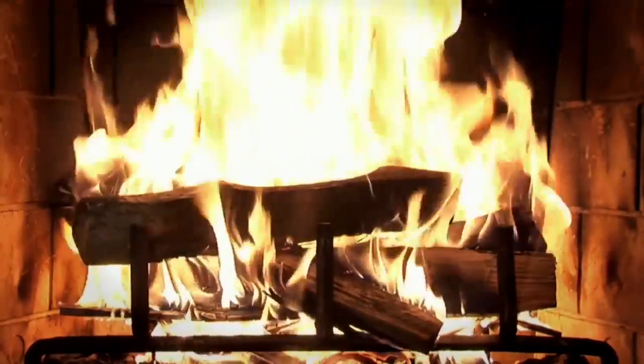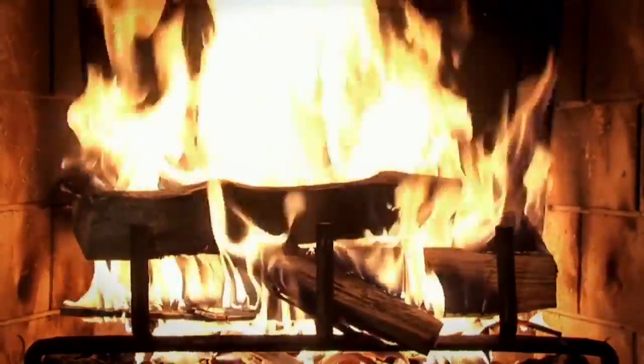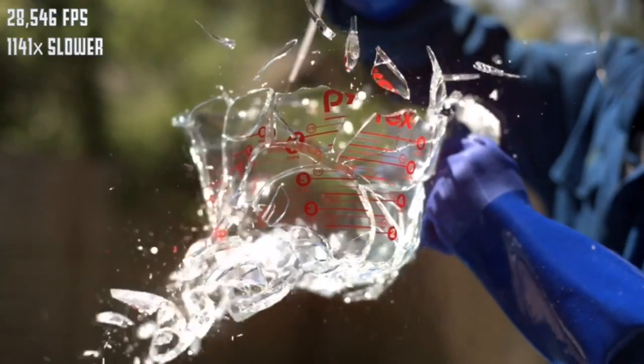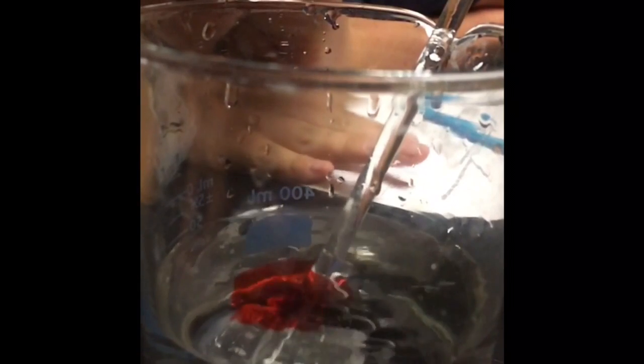Another way you can break a beaker or a flask is when you move it from a heating surface or a flame to somewhere colder. This too will cause the glass to shatter. A third use besides heating and measuring is mixing. Flask is good because it creates a protected area to combine liquids.